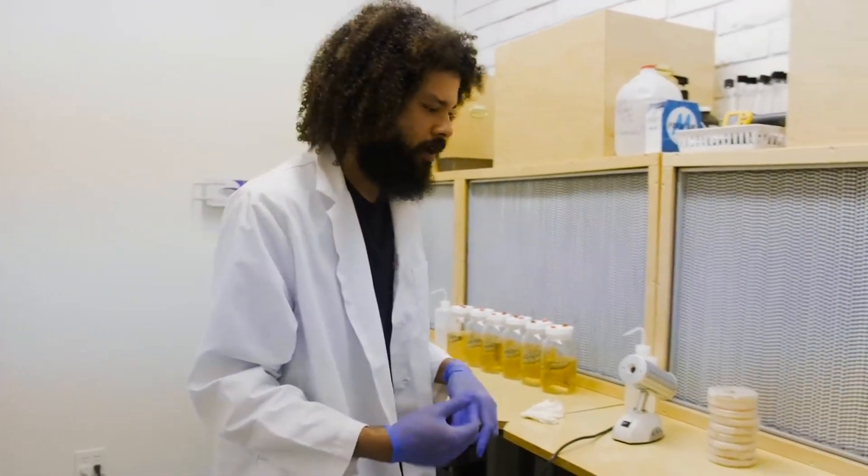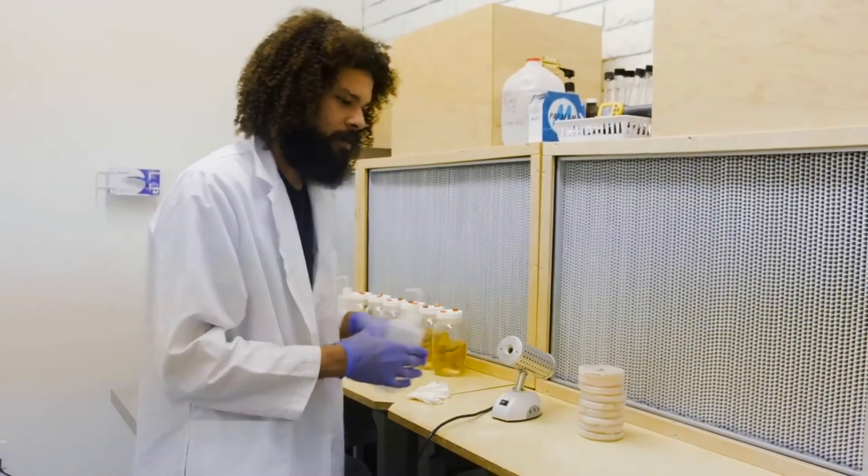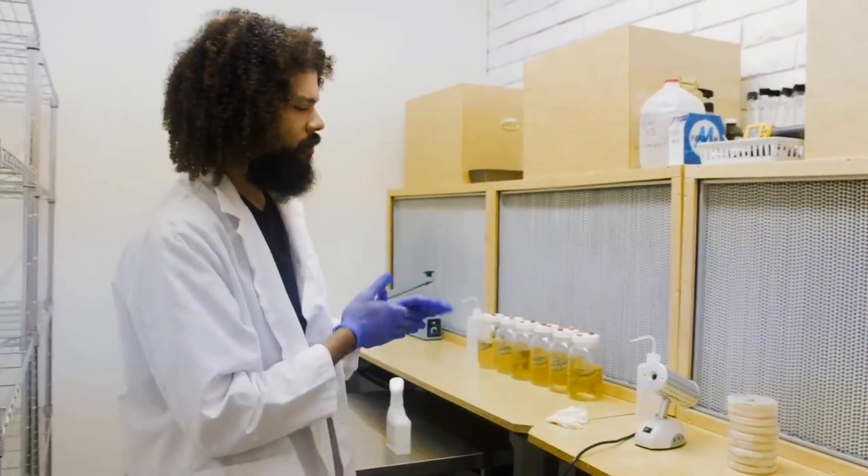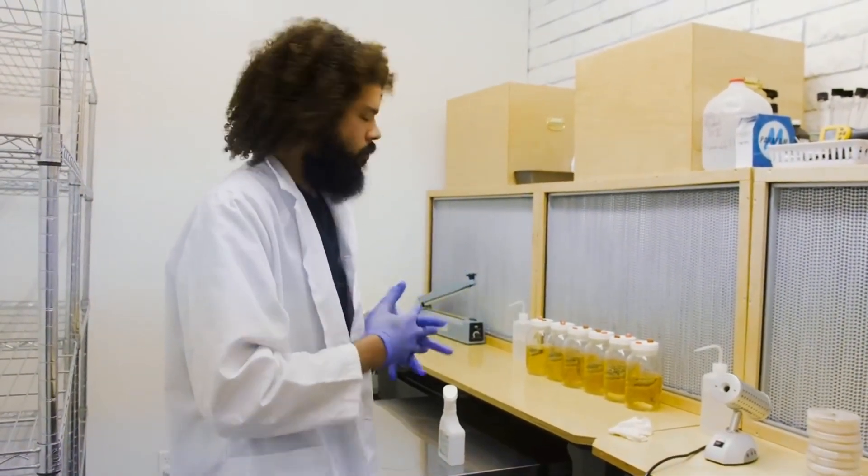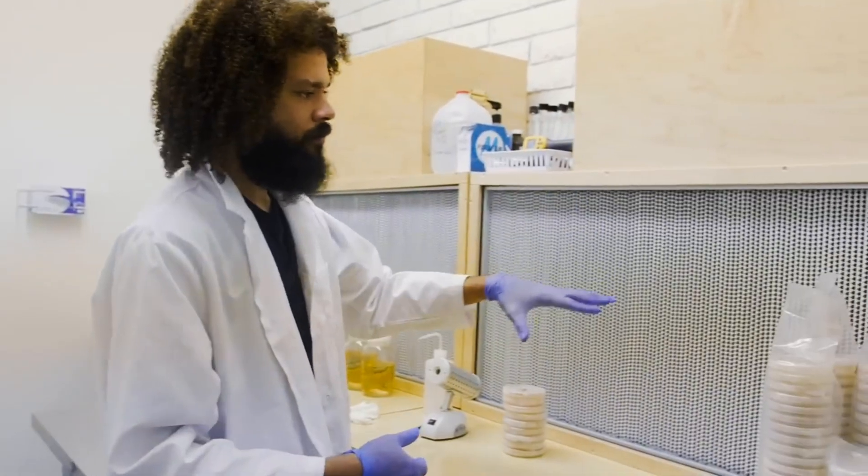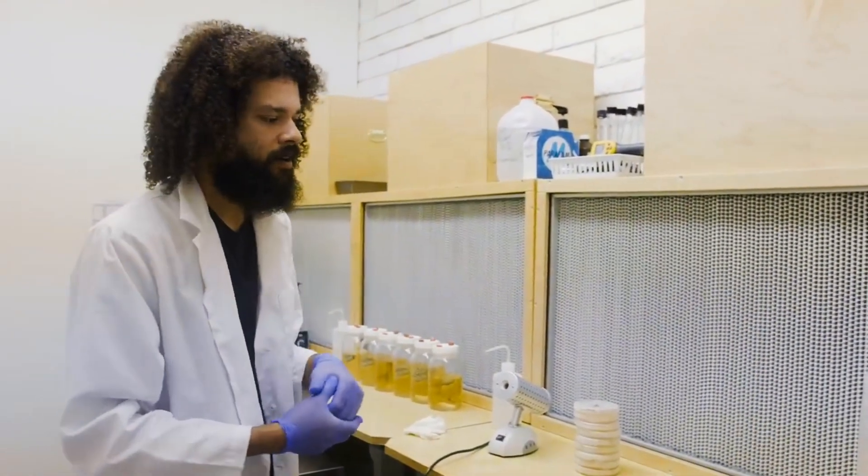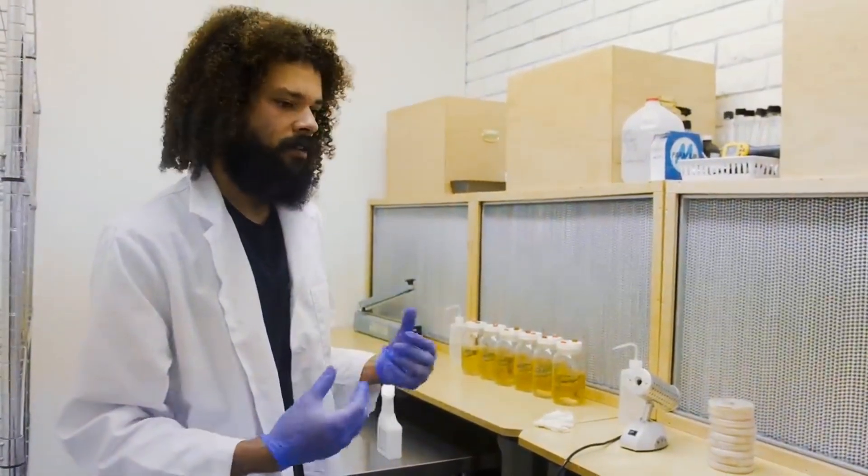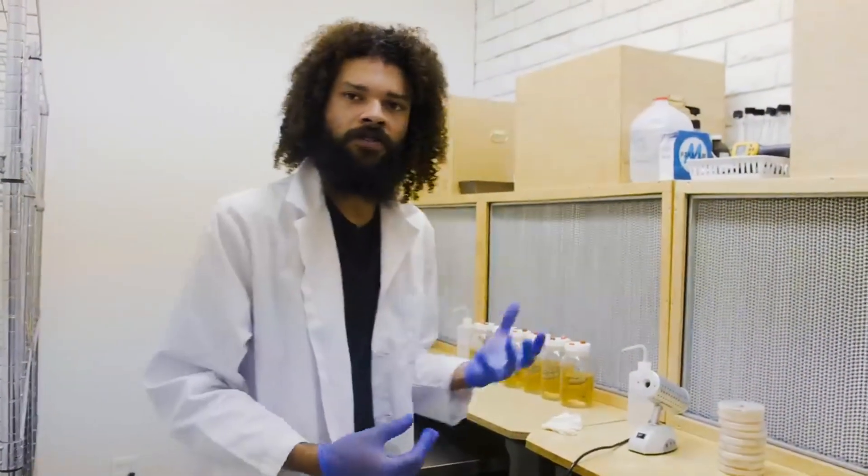Transfers, spawn production, you name it. Through the years I've added additional flow hoods as my workload grows. HEPA filters push out 99.99 percent sterile air that's been filtered down to 0.2 microns.